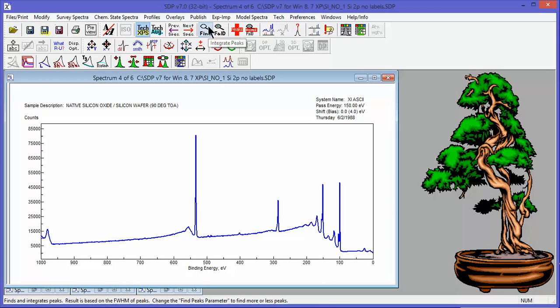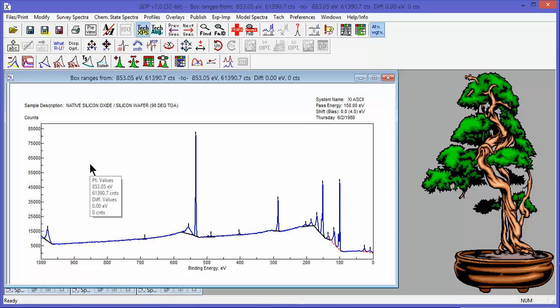Well, as we have shown you before, the first thing to do is to select find peaks, find integrate peaks, and then select the background: put the mouse anywhere and press the left mouse button. Now the black lines become permanent. They replace the red dotted lines. Now we can go in individually if we want to and just label each of these peaks.